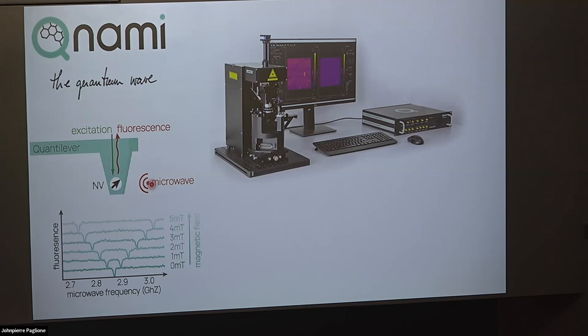So now most of your systems are dry, right? Correct. And how do you take care of vibrations? For example, if you want to do scanning tunneling microscopy. Somebody, I can't remember the research group, is trying to put an STM in an optical.